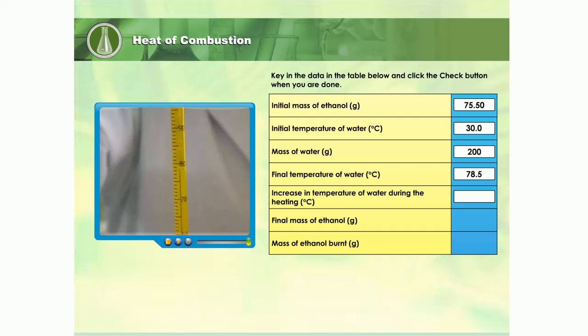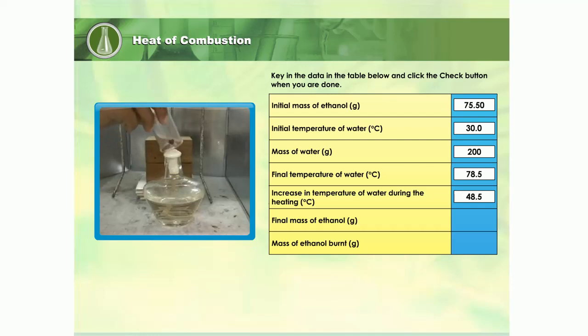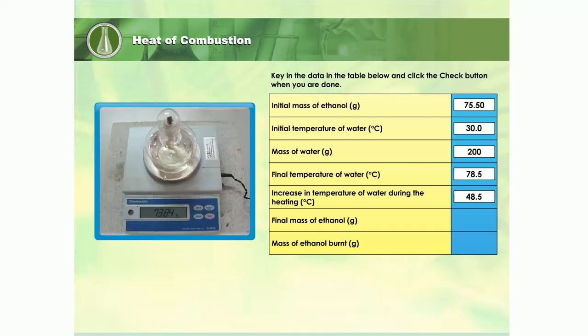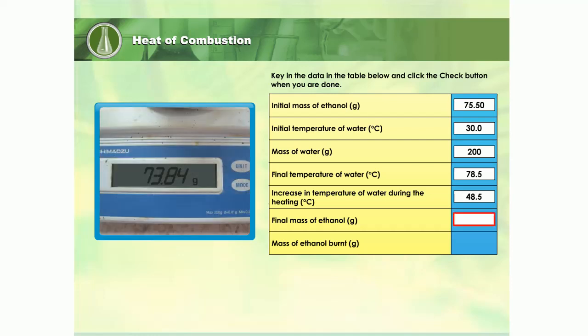Key in your answer in the table. The burner is weighed again on the digital electronic balance. Record its mass in the table. How much ethanol has been burnt during the reaction? Key in your answer in the table.